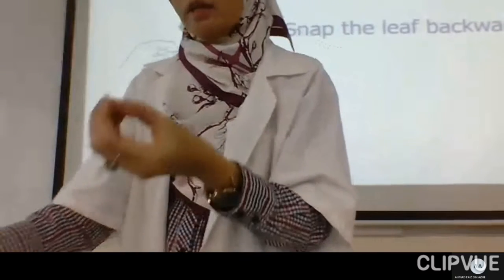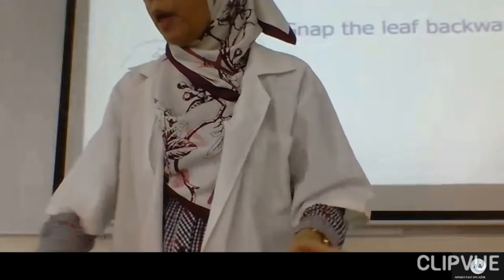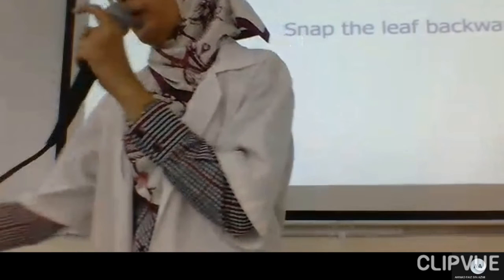Okay, a very thin layer, epidermis. Snap the leaf backward, then remove a piece of epidermis, a very thin layer, not a thick one, from the inner lining at the break point. And then mount it in a drop of water.